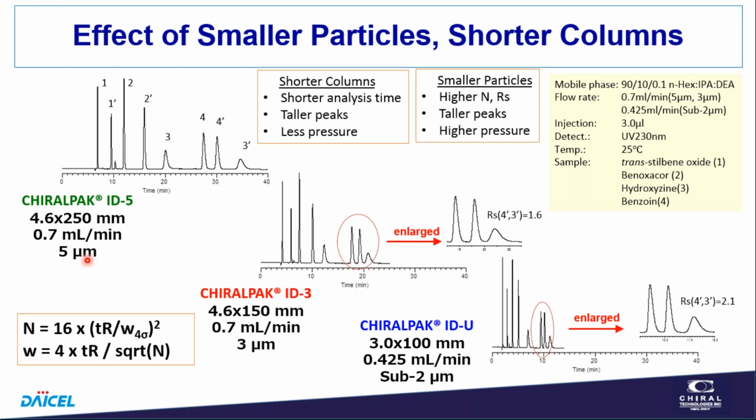So as we go to smaller particles, we do increase the column efficiency. We have about a 5/3 increase in the column efficiency going from 5 micron particles to 3 micron. And we have the equivalent decrease in column efficiency going to the shorter column, of about 3/5. Those cancel out. So for going from 5 micron to 3 micron and going from 250 millimeters to 150 millimeters, we should have about the same column efficiency, but we have about 60% of the analysis time. So we've reduced the analysis time.